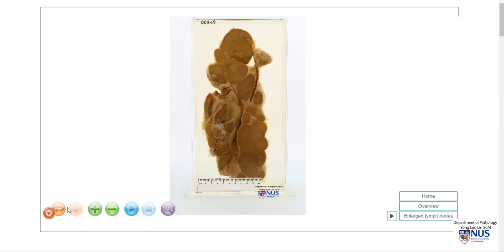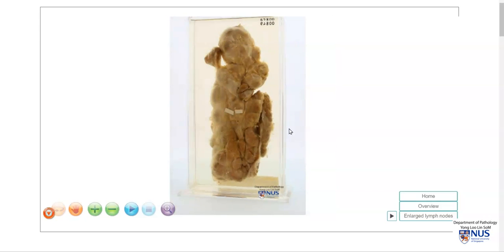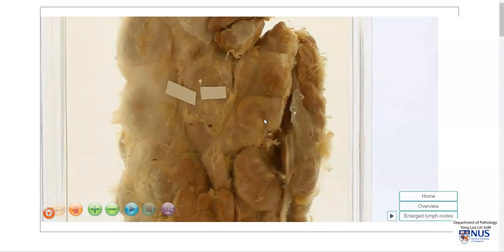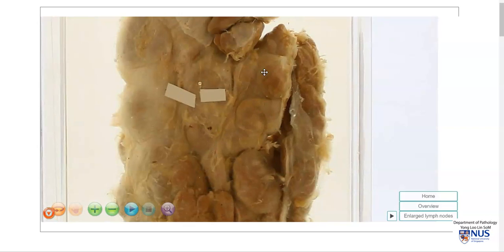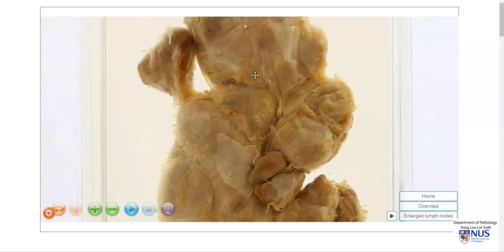Let's turn this specimen around, and on this surface we mostly see the capsule of the lymph nodes.